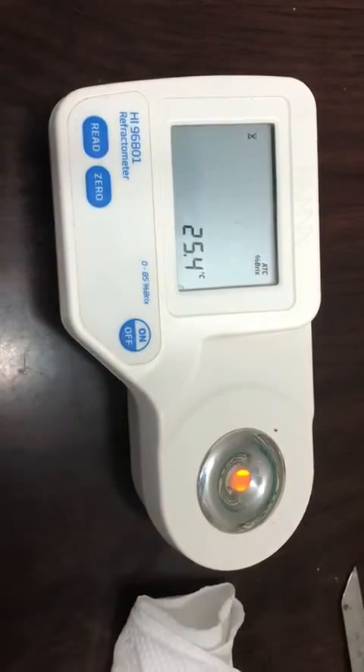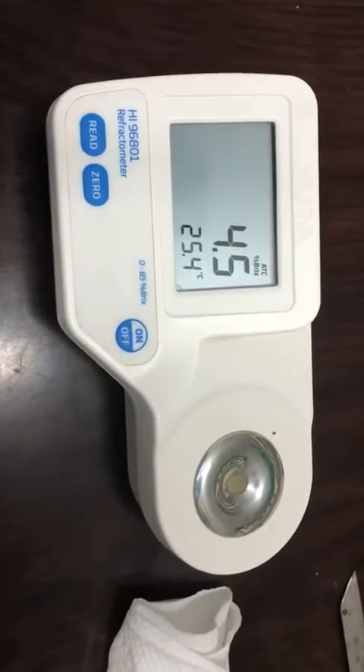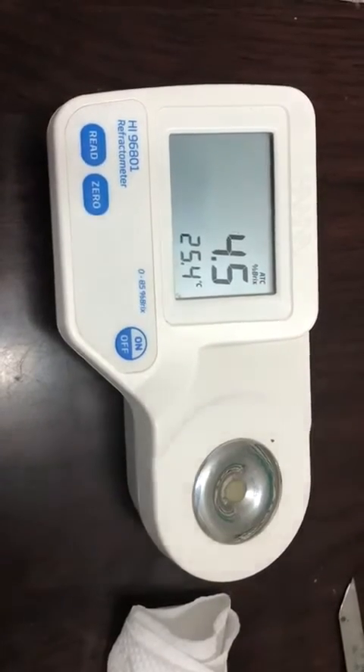You can see the value seems to be 4.5 percentage Brix.